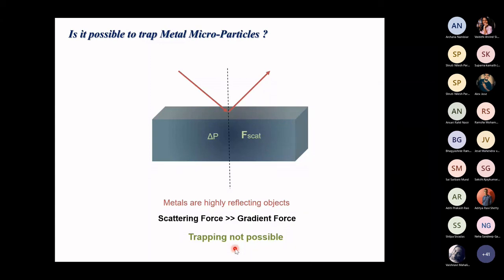DNA recoiling force calculation, and the kinesin motor in the intracellular pathway. So now let us pose this question. So far we have talked about optical trapping of a dielectric particle. What is a dielectric particle commonly perceived as? Physics says dielectric particle. What do we mean by that? A non-conducting particle. It doesn't conduct.